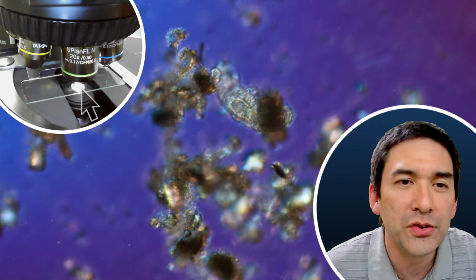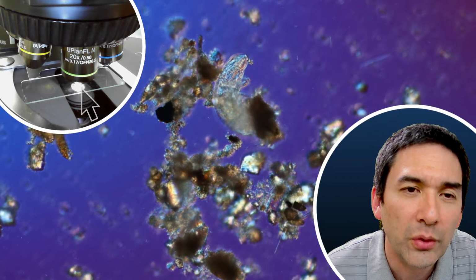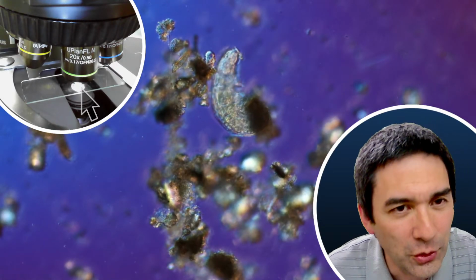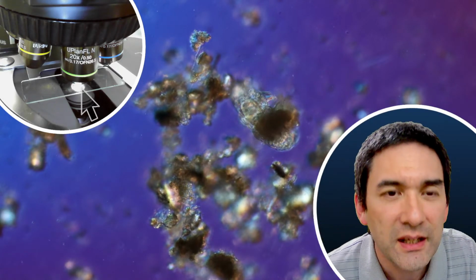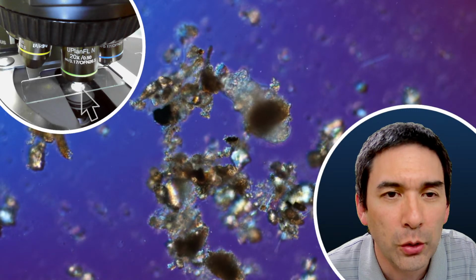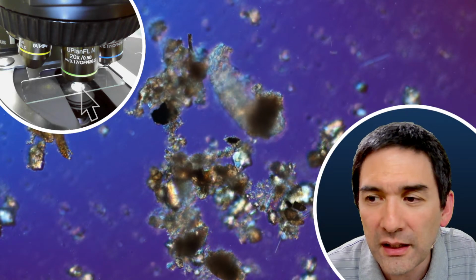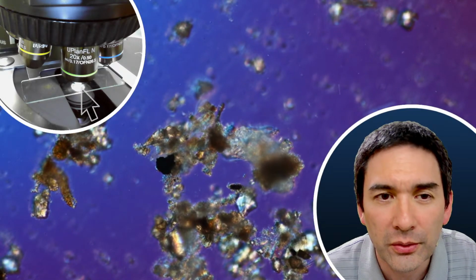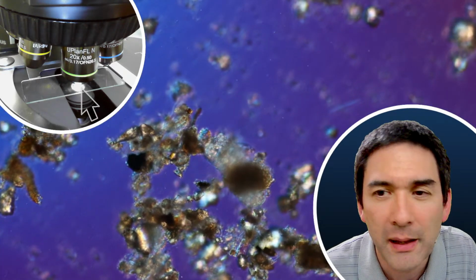Also interesting here, in the tardigrade, you're sometimes able to look into the organs that they have. If you were to zoom in much more, which I cannot do now because I don't have a cover glass on top here, it's risky, then you could also see the individual claws. I'm going to read through the comments again, and then I'm going to show you a video where I dried a tardigrade and brought it back to life.